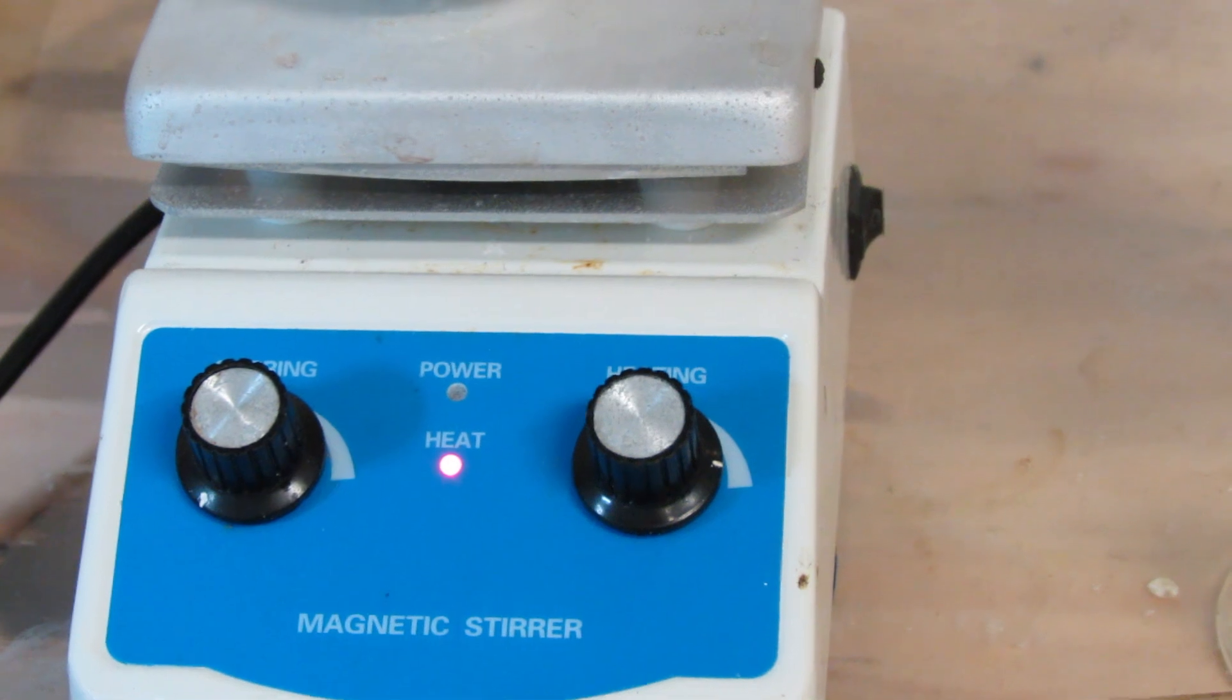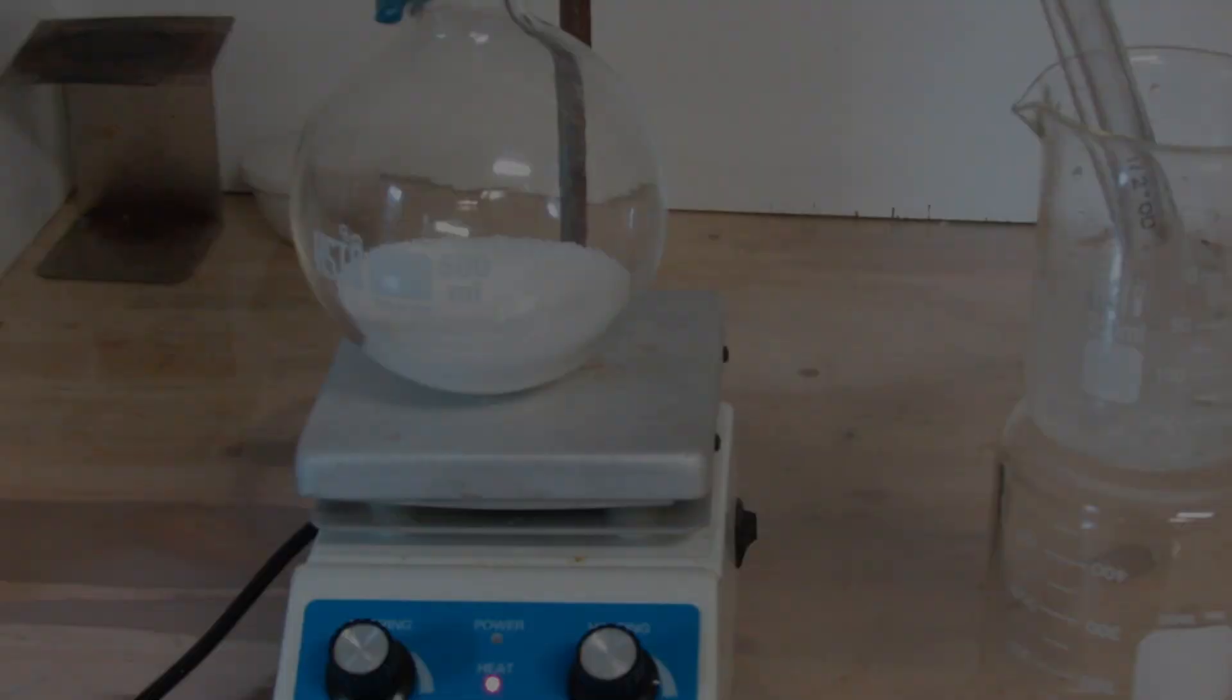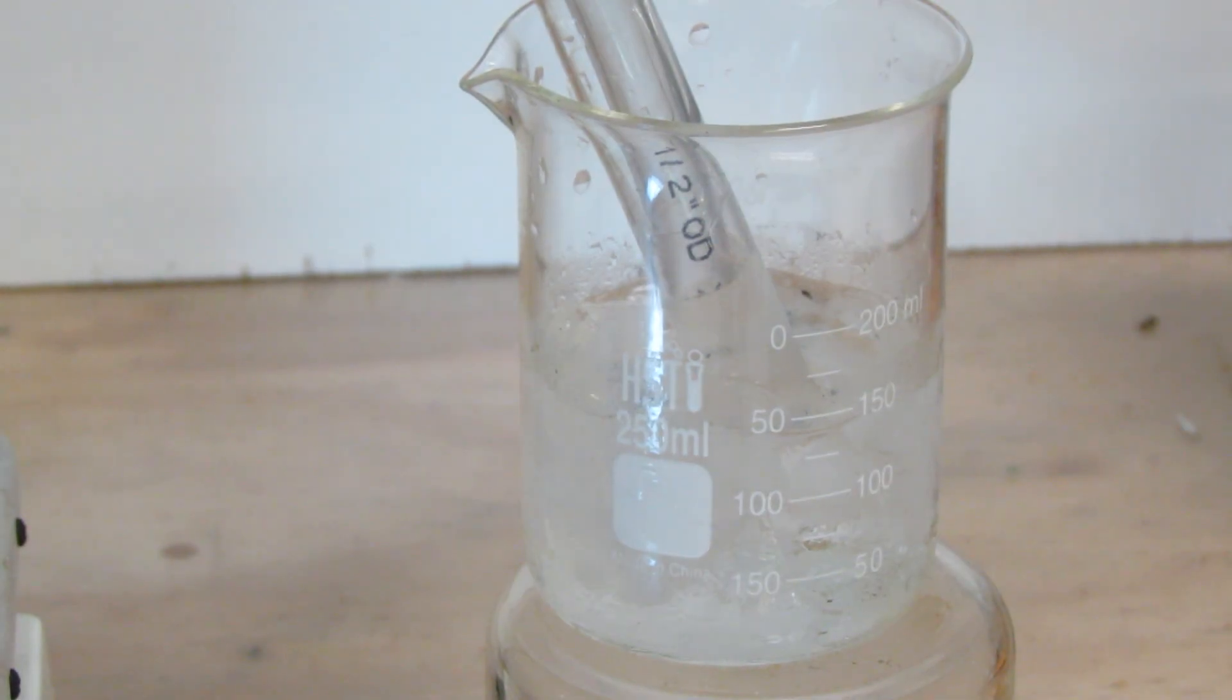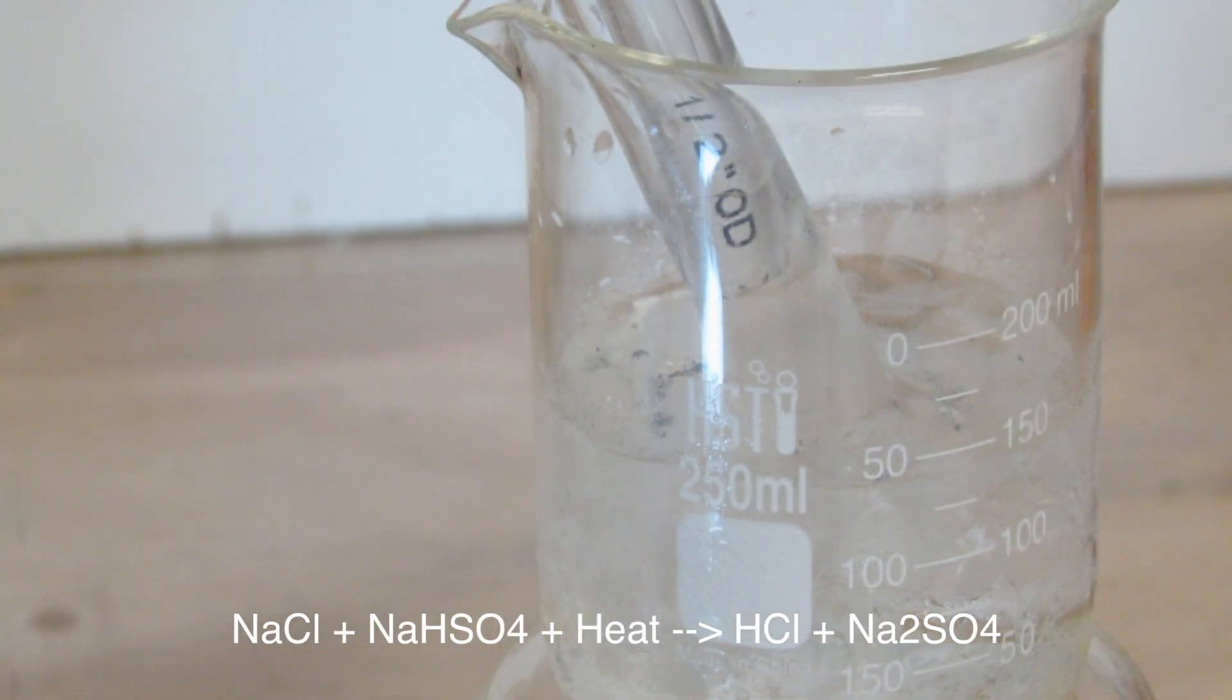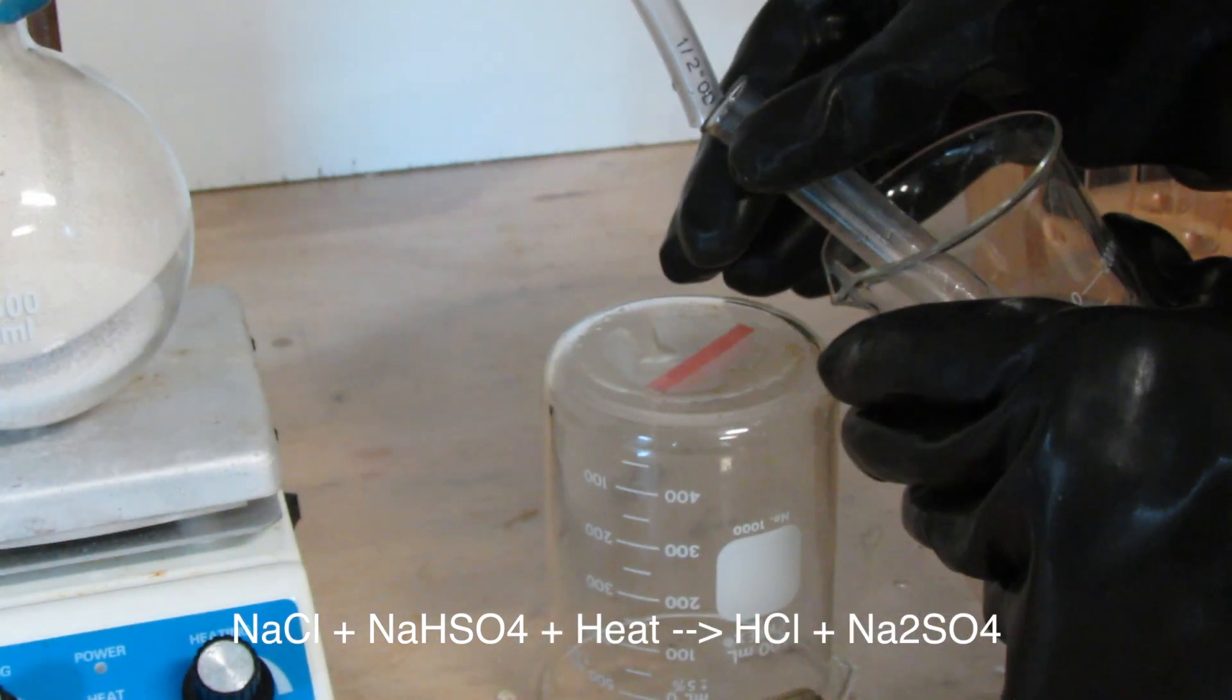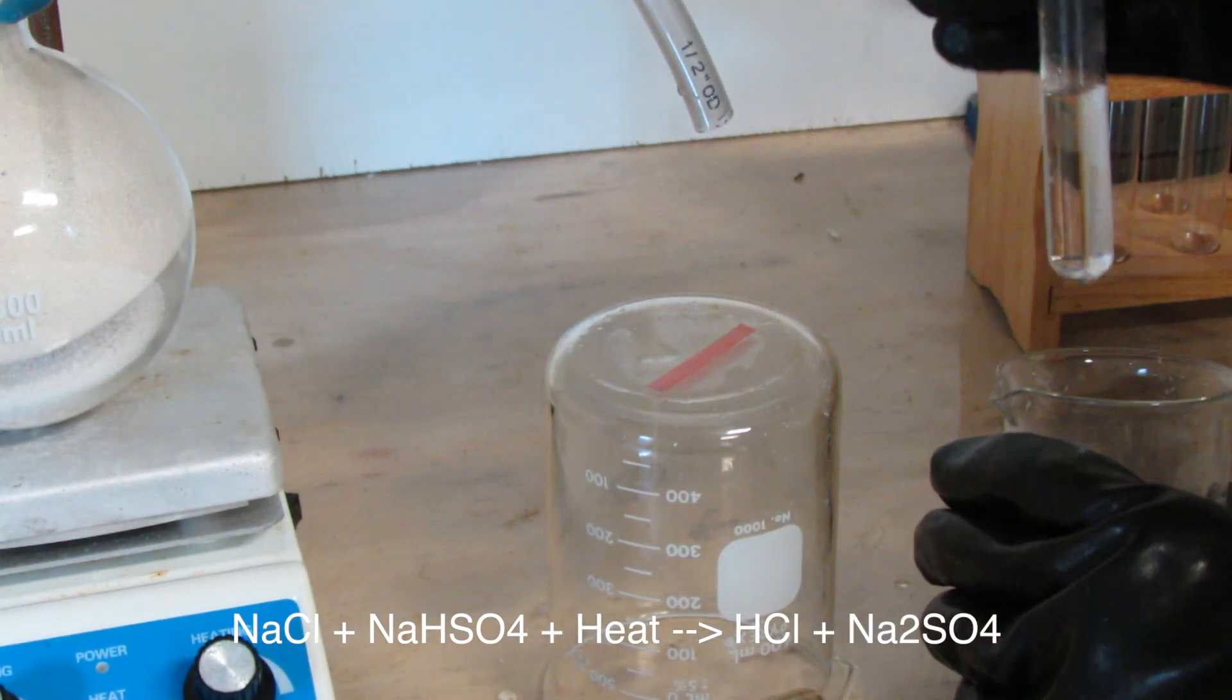When you are ready, begin heating and the hydrogen chloride will begin to be produced. At first the bubbling is very slow, but it will begin to speed up over time. You can see the bubbling rate increase significantly. When you think enough is dissolved, take it out.